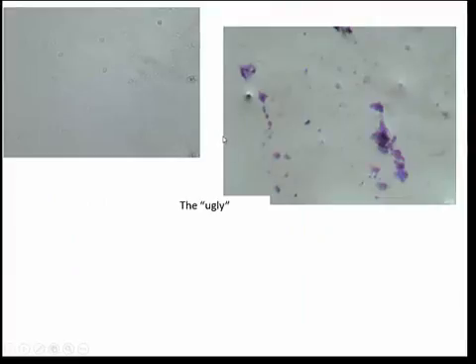Now you may say, but Dr., well, that looks like a human cell. Well, it kind of does, but this came from a supposedly pure bacterial sample, so we know that it's not, there should be no human cells in there, right? And then this right here, this was supposed to be a stained slide, and the student submitted this, so there's nothing there. There's just various pieces of garbage, debris, optics. When you're getting used to these microscopes, sometimes it's maddening because you're like, I can't see anything but this. My guess is that the student had this out of focus, and that if the student focused in more, maybe these are actual cells, but it's hard to tell.